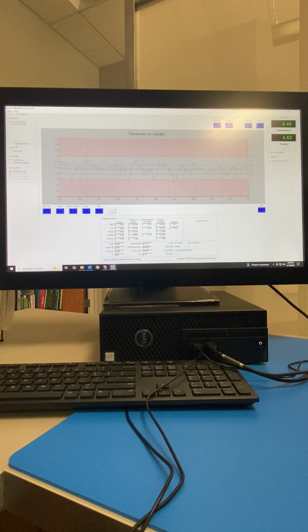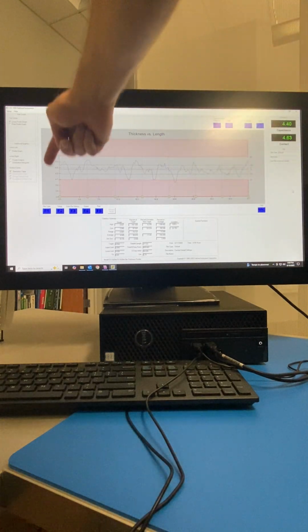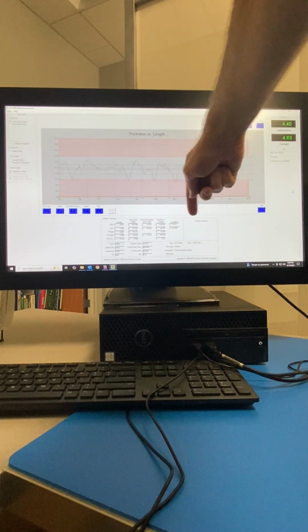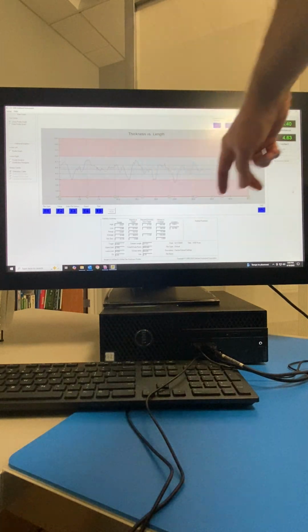The software that runs the CX-1025E thickness profiler has been updated recently to a Windows format. In the top center of the screen is the profile information, the profile graphic. Bottom center of the screen is the statistics at the end of the sample run.